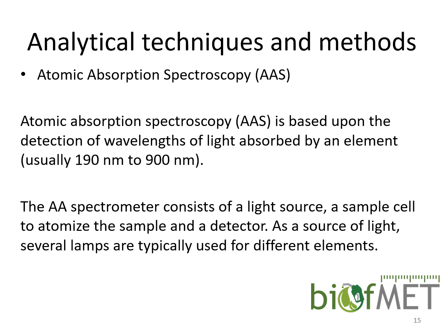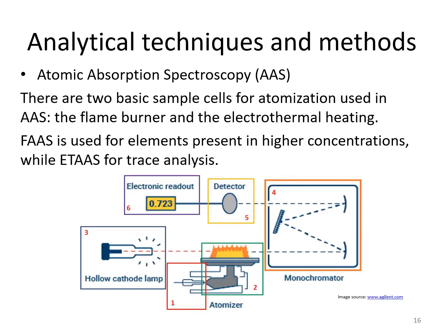the element. It's usually starting from the near UV part to the near infrared part, covering all the visible spectra. And usually as a light source you have a hollow cathode lamp of certain elements, so you need to analyze element by element. Here you can see the scheme of such instrumentation.